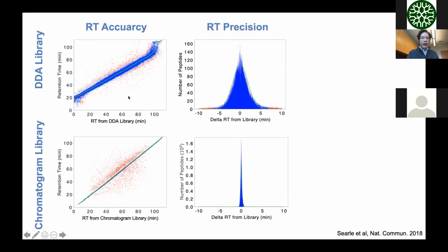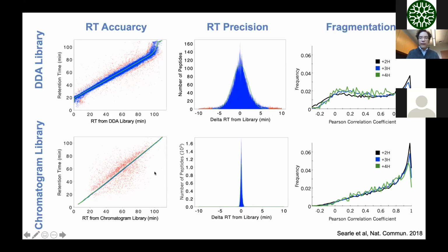So instead of looking at retention time tolerances of plus or minus 5 minutes, we're looking at retention time tolerances of plus or minus 20 seconds in these experiments. And this absolute accuracy and precision of the retention time, because we haven't done physical or chemical fractionation, we've only done gas phase fractionation post column, actually gives us a lot more confidence in our measurements.